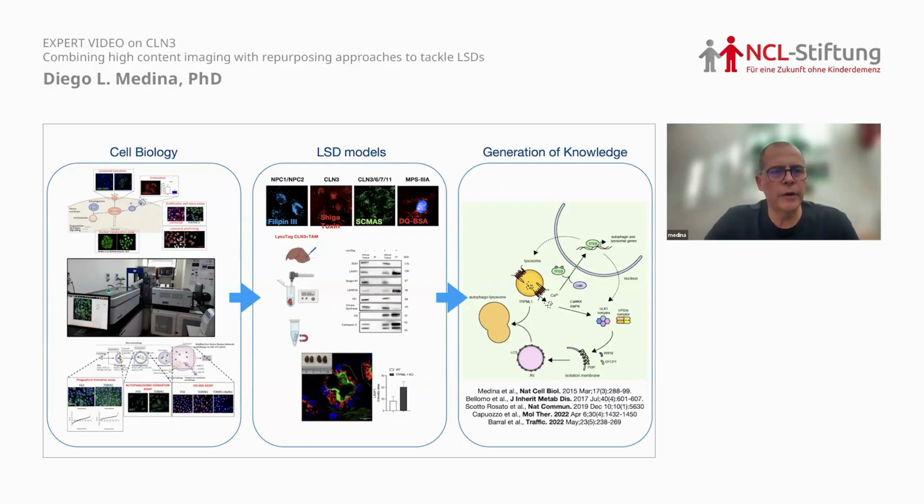So we basically use state-of-the-art cell biology approaches, combined with high content imaging technology, in order to investigate different intracellular processes such as lysosomal pathways, autophagic pathways, and the subcellular localization of specific factors that are important for lysosomal biology, and use this as a toolkit of assays that we can use in specific models of lysosomal storage disease in order to phenotype pathogenic pathways in these specific models.